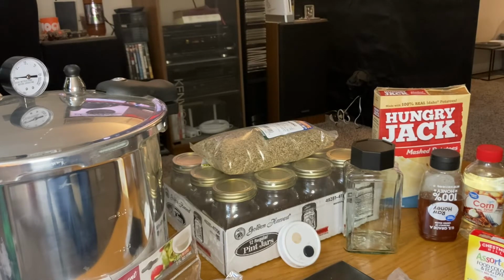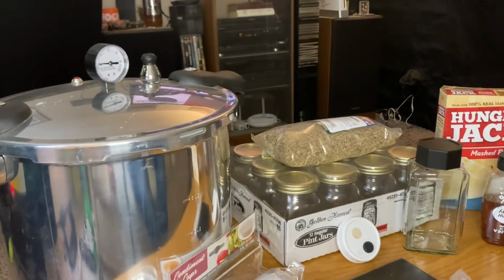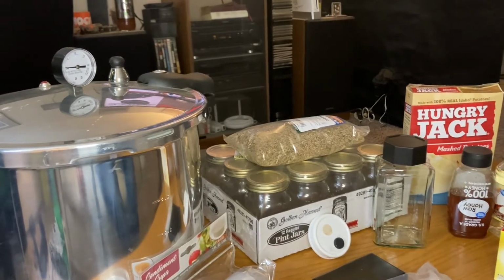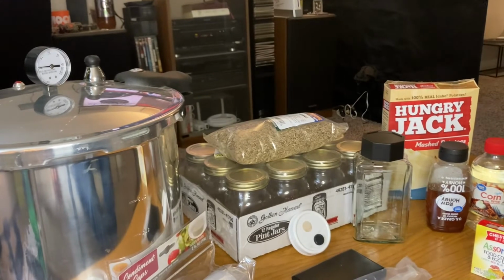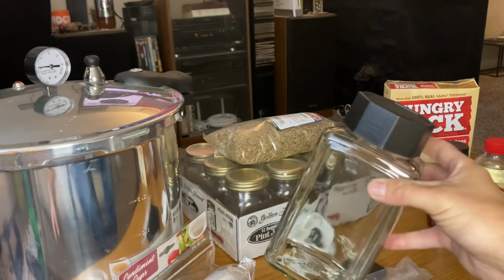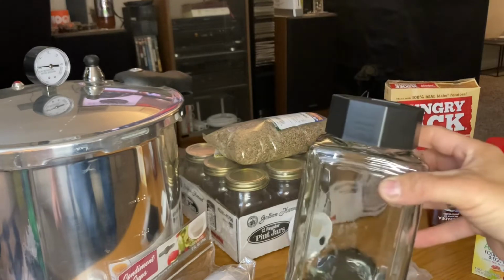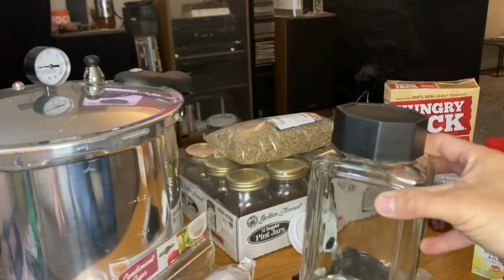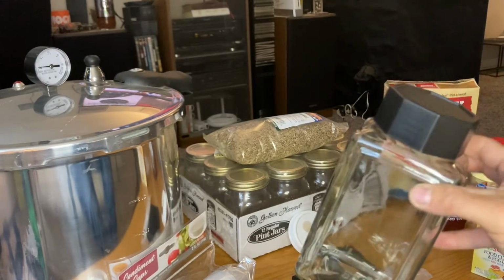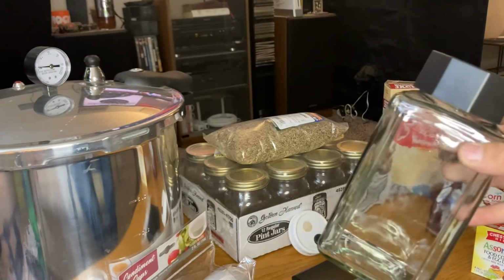You will also want a pressure cooker, which I have right there just to the left, for both of these processes. To make your own agar and to make your own ryeberries, you're going to want that as well. Now I have this jar right here, which is what you'll use to mix all the agar solution in, and then you will cap it and have it about a quarter turn back so it doesn't seal completely when you go to pressure cook it. And then you'll pressure cook this at 15 psi for about 30 minutes. It'll still be liquidy in there.